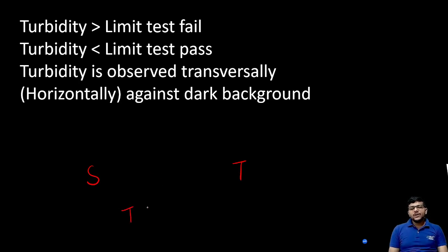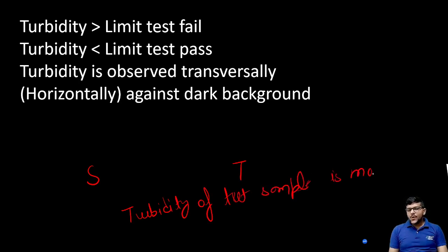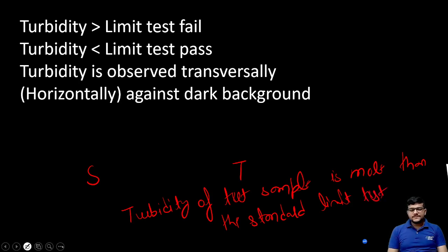If the turbidity of the test sample is more than the standard, then the limit test fails.